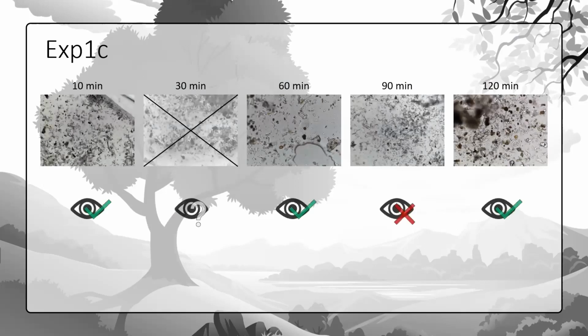We will look later on in more detail. I tried my best to look into the microscope and make some visual confirmation if there are some spores. It's a little bit limited because you can't magnify it that hard, because it's an open droplet and I don't want to collect the sample on the objective.